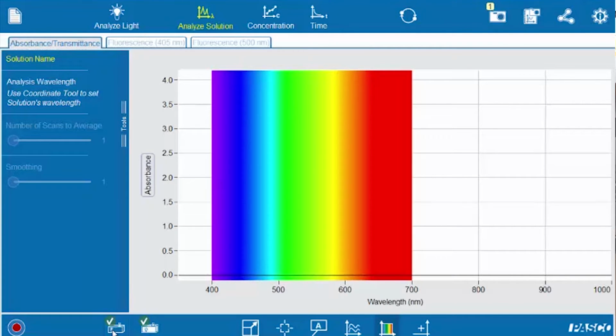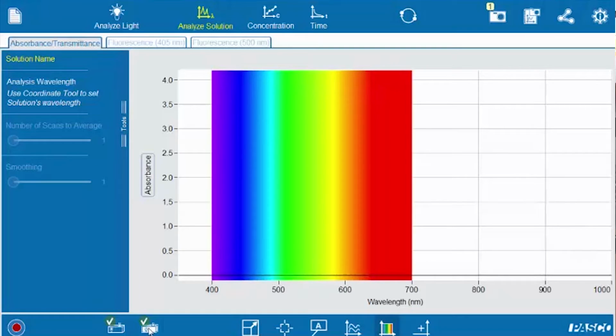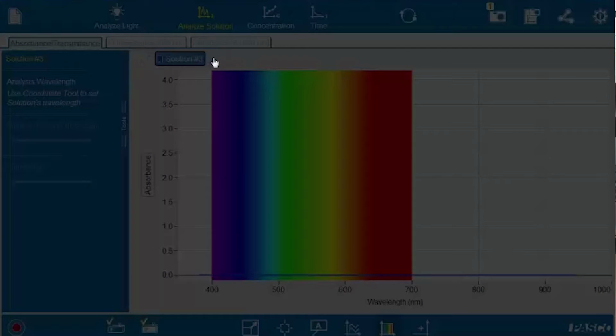And then you perform a light calibration. So you click this button. And what that does is if the solvent itself is absorbing any light, it's just going to blank that out. So now if I press record and start measuring absorbance, you can see there's a completely flat line here. So you're probably not seeing anything, and that's good. What we don't want to see is any peaks from our solvent absorbing any light. So I'm going to press stop. It's going to delete that.